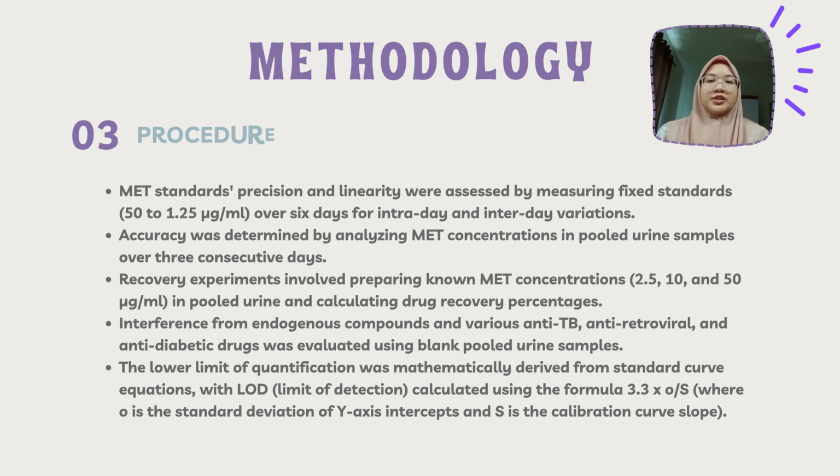Further procedure for the HPLC. First of all, metformin standard precision and linearity was assessed by measuring fixed standards over 6 days for intraday and interday variation. Then, the accuracy was determined by analyzing metformin concentration in pooled urine samples over 3 consecutive days.